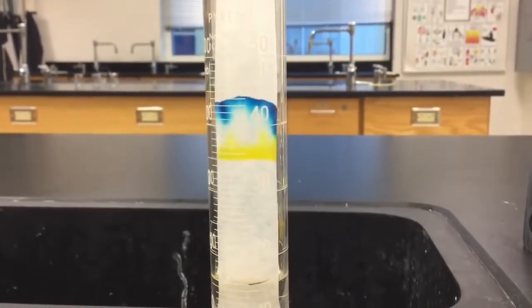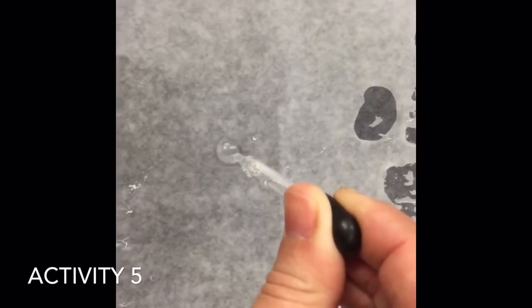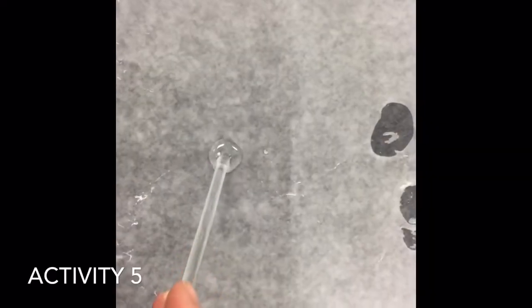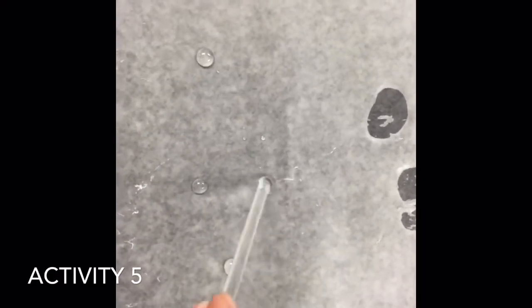We're just above the 40 mL mark. We're going to place about five to ten drops of water in the middle of the wax paper, waxy side up. Then I'm going to take our glass stirring rod and try to separate this drop into many smaller drops using a little bit of force. We are able to separate the drop into many smaller drops.